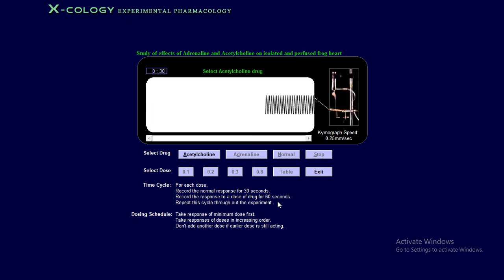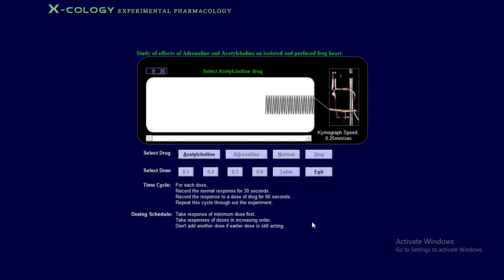The time cycle is 30 seconds normal response, then 60 seconds drug response. For the dosing schedule, first take the response of the minimum dose first. Always try to add the minimum dose in that particular perfused tissue. Second, take responses of doses in increasing order — like a graded response: 0.1, 0.2, 0.3, and so on. Do not add another dose if the earlier dose is still acting. First take the complete 60-second response, then add the next dose.